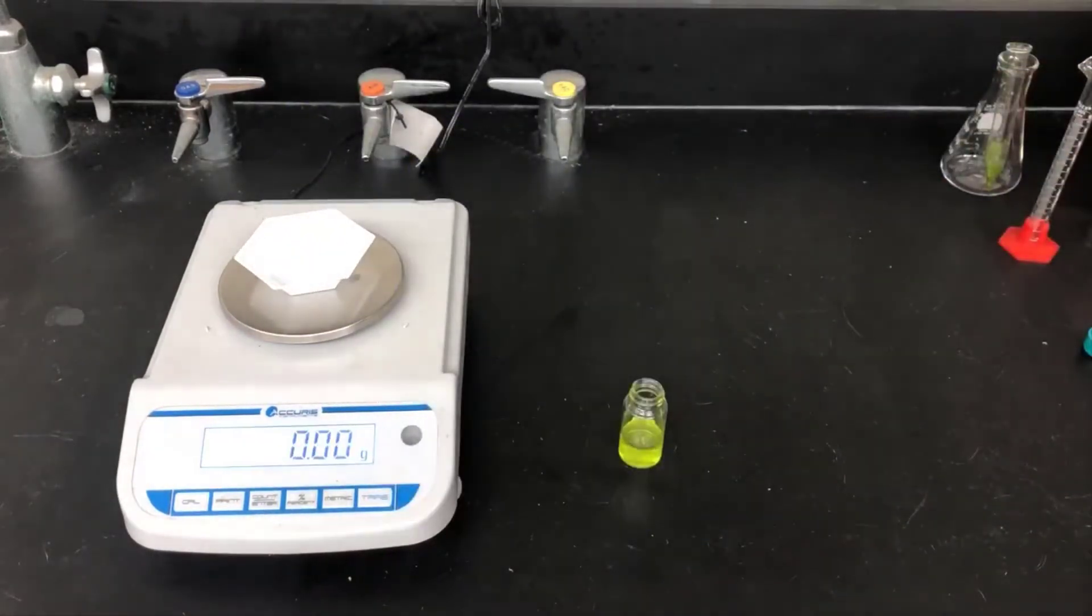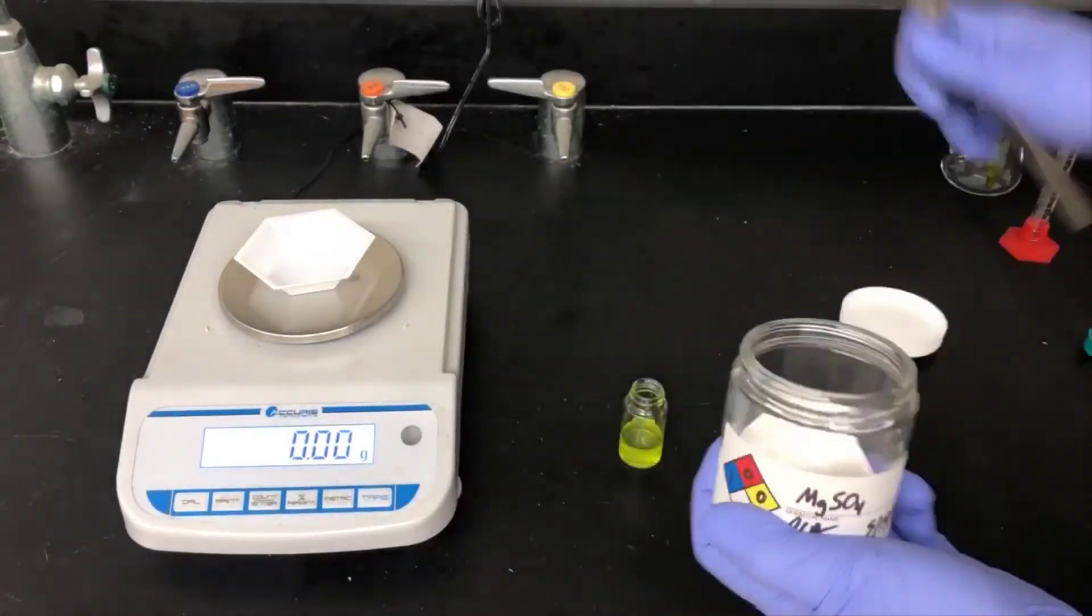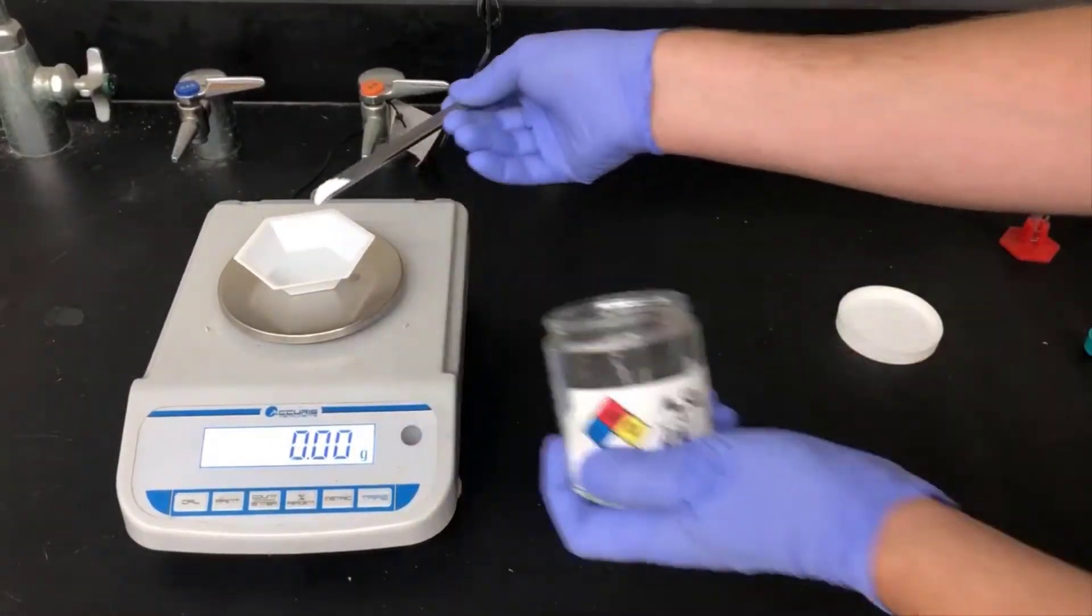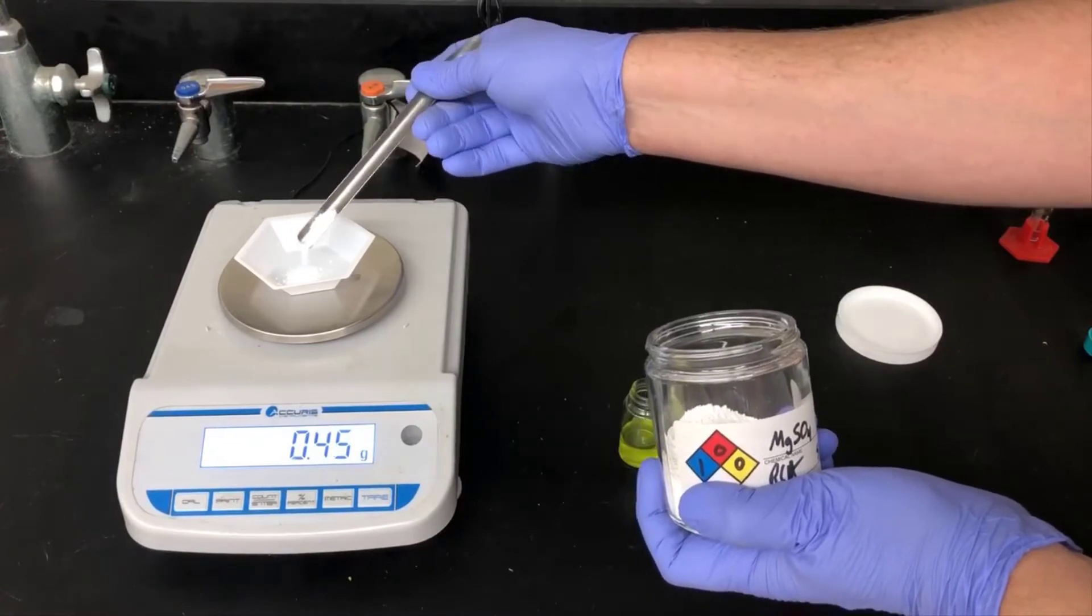Now, I'll weigh out about 1 gram of magnesium sulfate. This is a drying agent that'll be used to remove the water that comes along with the citrus zest. It's not important that you get 1 gram exactly, but somewhere close is good enough.